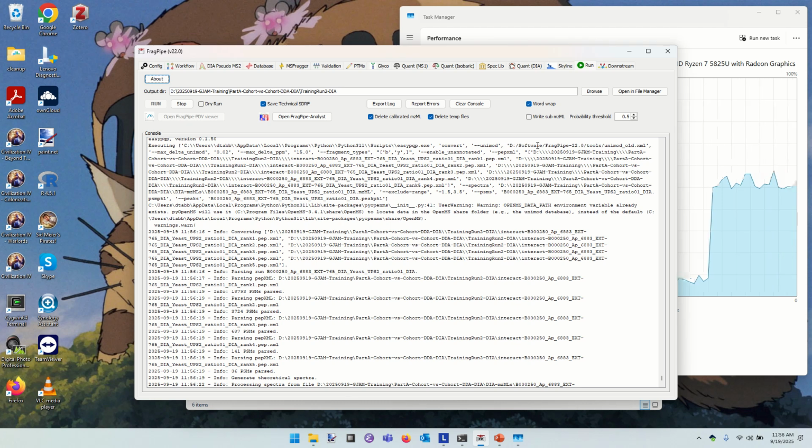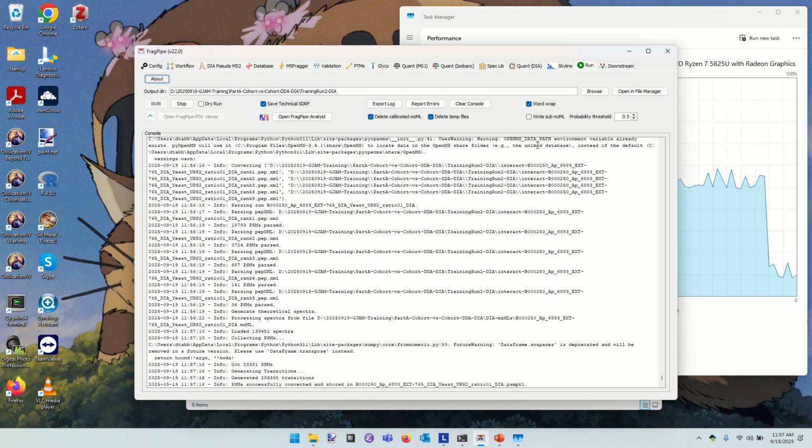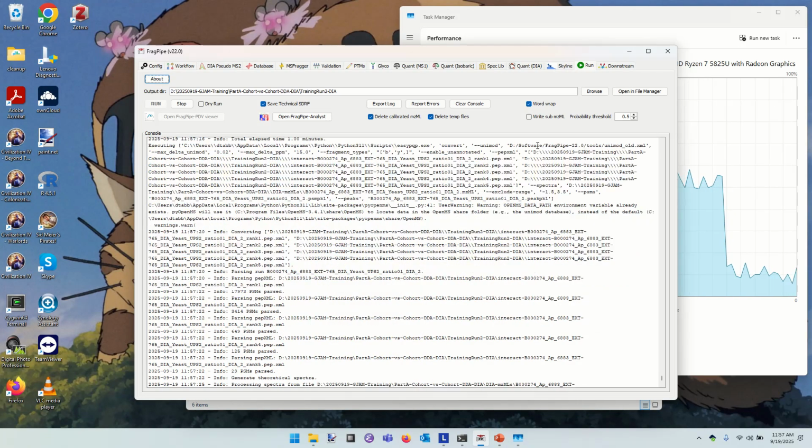Do you see this business about rank 1, rank 2, rank 3? Like right here? This is to say that the software has attempted to identify the MSMS scans in a way that says, my best guess of a peptide that relates to this MSMS is this peptide. That's a rank 1. It then removes those ions and says, what's my second best guess for explaining what's left? That's my rank 2 peptide. So you can see that it's keeping up to 5 for each MSMS. Any peptide that doesn't make it into the top 5 of at least one MSMS is jettisoned. So that may represent a difference in how Pulsar or DIA-NN would go about identifying than this does.